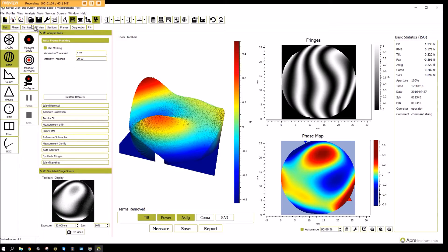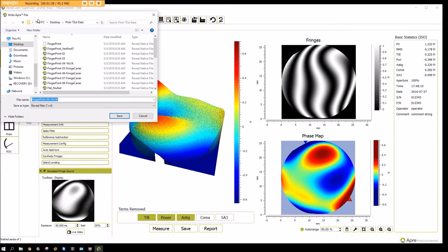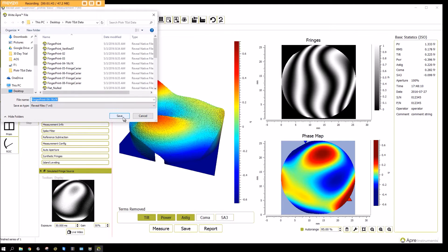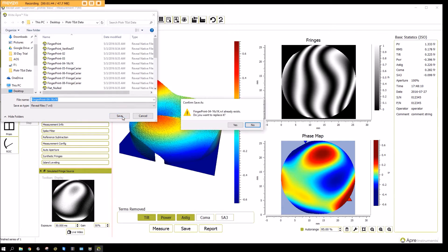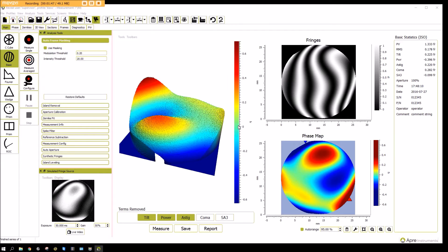Data can be saved in many formats. Here we show it saving to the native format. We can save it — and that's an example of how to measure with Reveal.